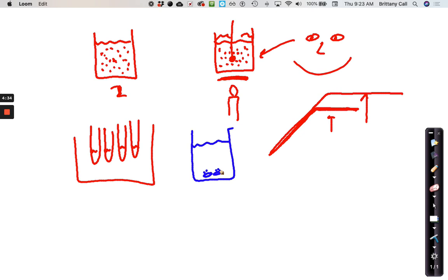All right, then you're going to set up your ring stand so the hottest part of the flame is directly beneath the wire gauze. Here's my wire gauze, here's my flame. Right? And we're going to get it going. Good? Okay, when it's set up, heat the water to boiling. So you're going to heat it, you're going to get it to boiling.